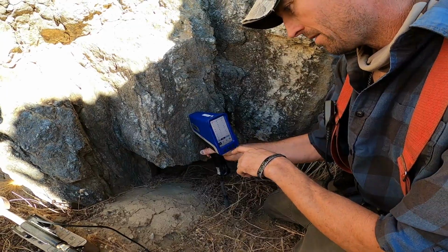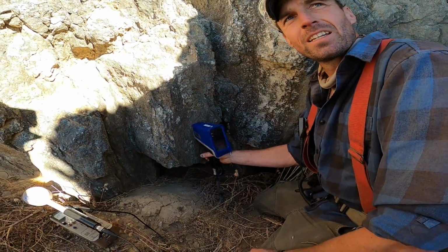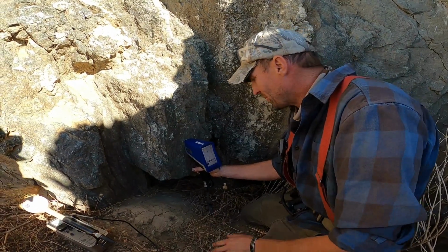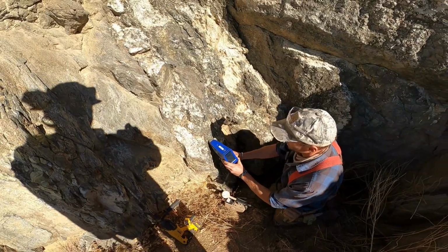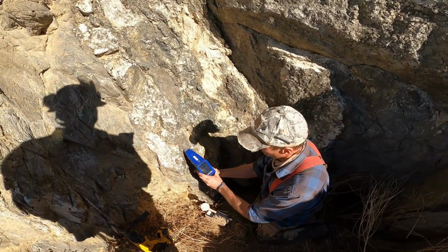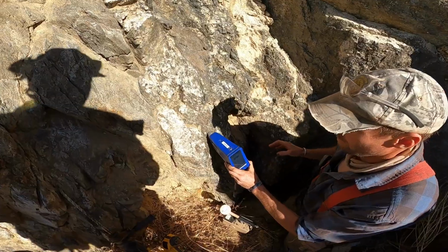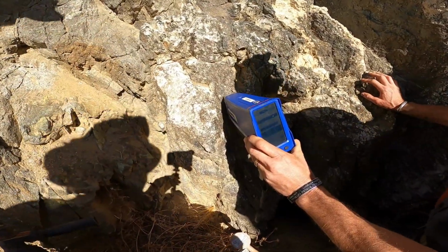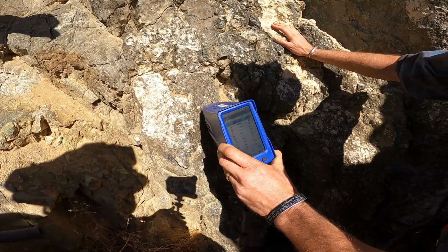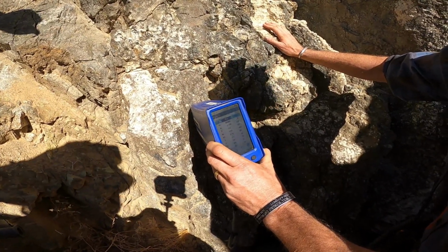I forget if that's a heavy or a light rare earth. What element was that again? TE? Tellurium? Yeah, tellurium here. Cool. That's a first. We didn't really start seeing scandium until we got on the uranium side of things, right? Yeah. Did you shoot right where we drilled the holes? Yes, sir. It came back around 5,000 parts per million total with all the, just quick math.